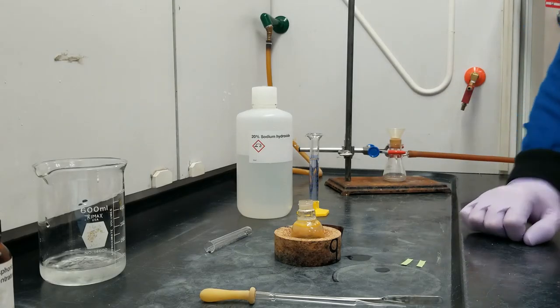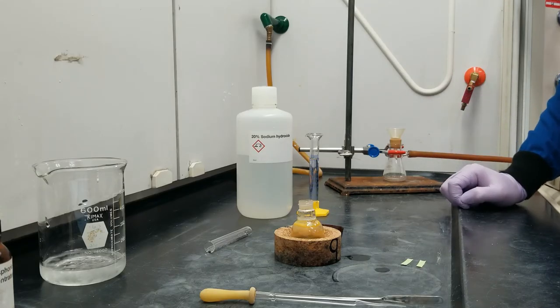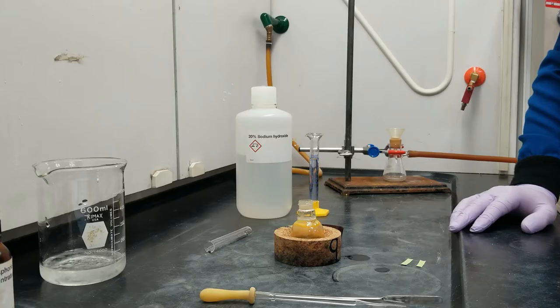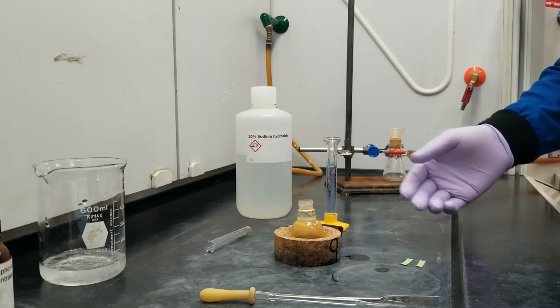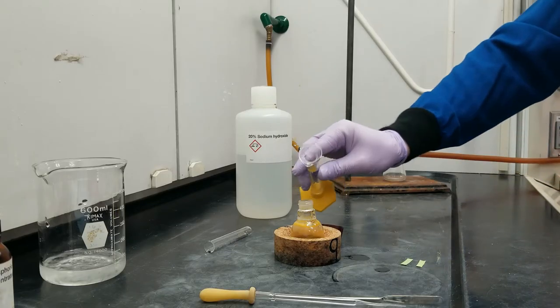We're going to do this by vacuum filtration with our adorable little Hirsch funnel here. But first, we have to make sure that everything is solidified. And in order to do that, we are going to use 20% sodium hydroxide in order to make the solution completely basic. So we're going to start with the recommended 10 mils. Make sure that it's basic by pH strip here. And if it's not, not a big deal to add more.